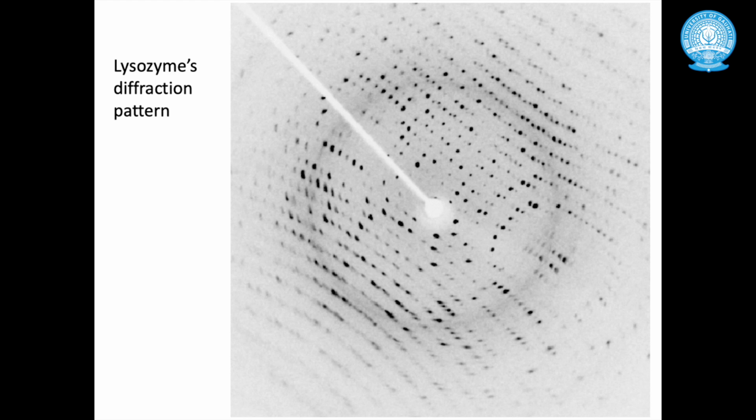All this background information combined together helps us decode the dots obtained with the X-ray diffraction pattern.